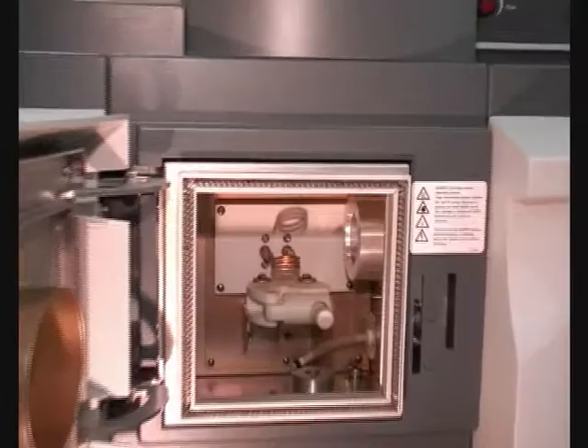Open the door to the torch compartment. Insert the snout into the instrument.